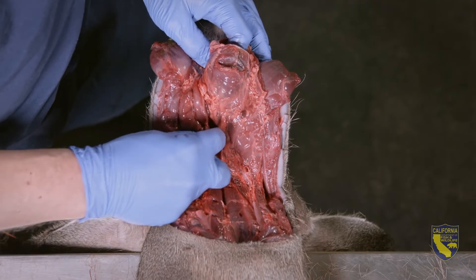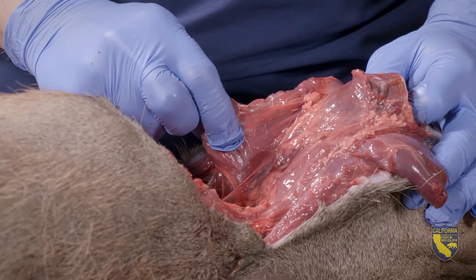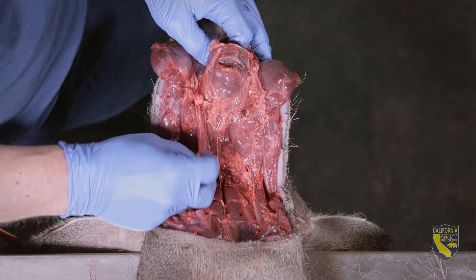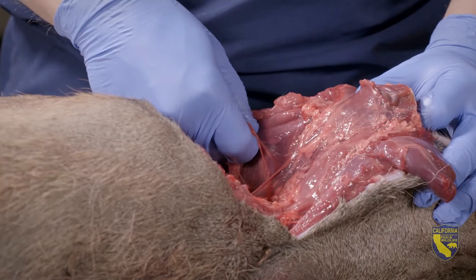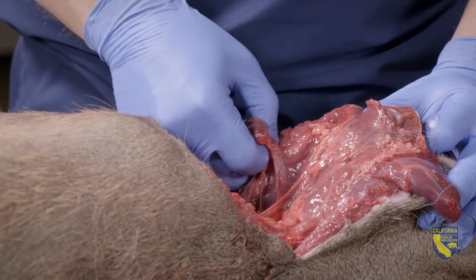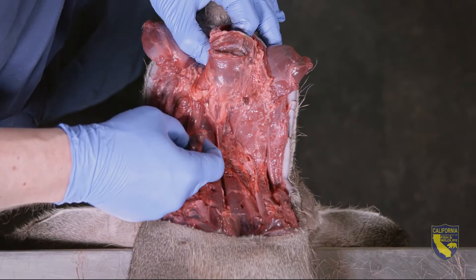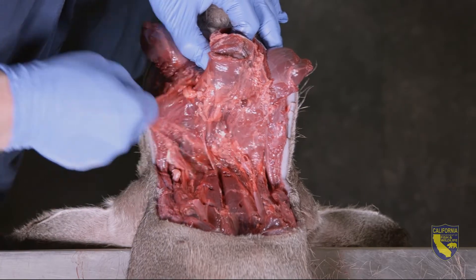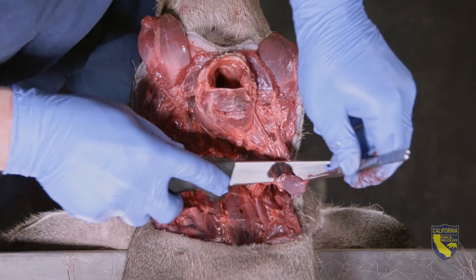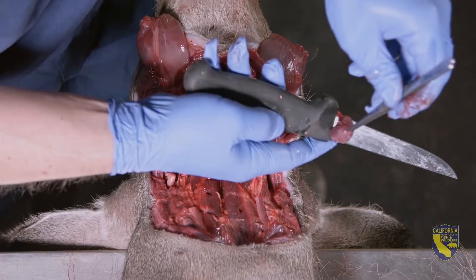You can tell it's a lymph node by feeling it. It should be a discrete, semi-firm structure that slips through your fingers when gently pinched and pulled. Most of the time, you should be able to work the lymph node out with your fingers. Gently dissect around the lymph node with your index finger until you can grasp it and pull it free from the surrounding tissues. You can also cut the lymph node out using a knife and tweezers.